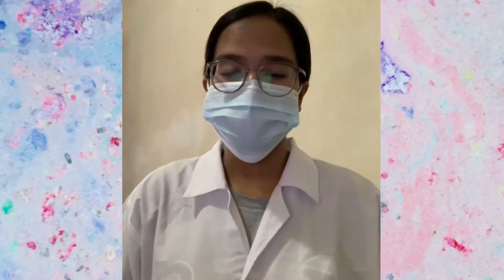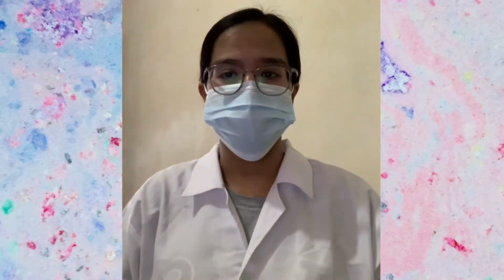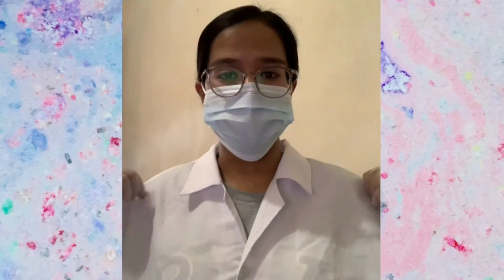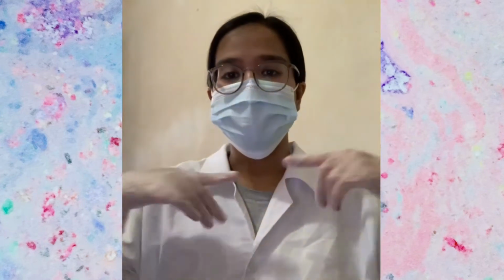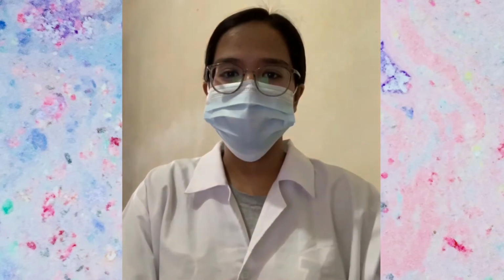But before we start our demonstration, we should make sure that we are wearing our personal protective equipment, or our PPE. Make sure that you have your lab gown on, your gloves, and a mask for our safety. So without further ado, let's start our embedding procedure.